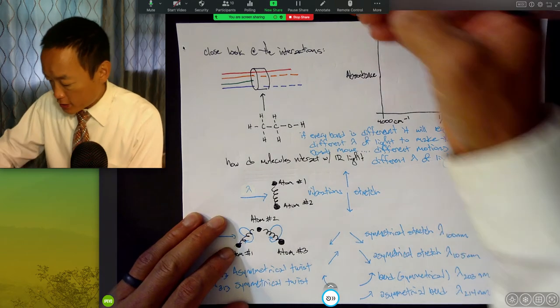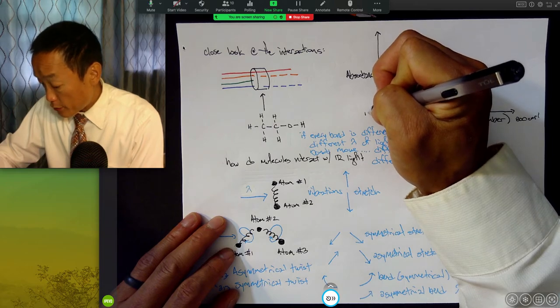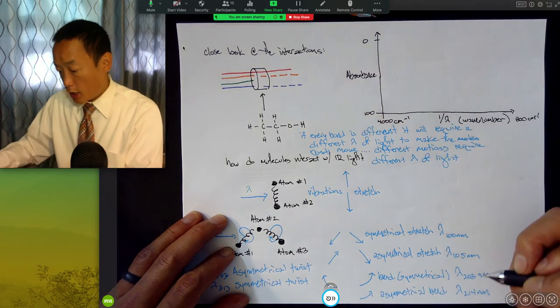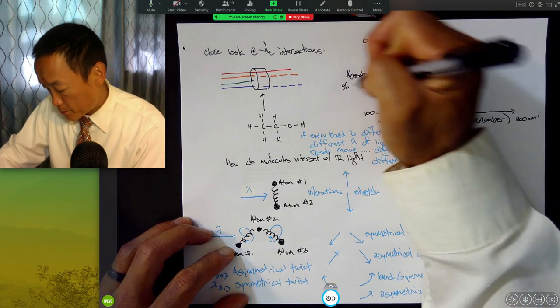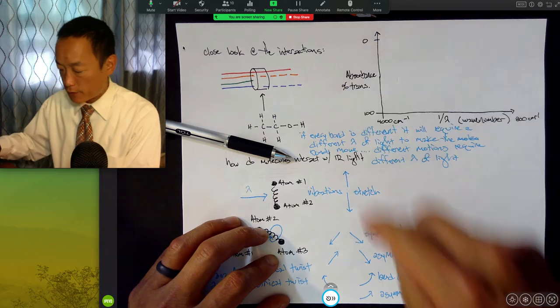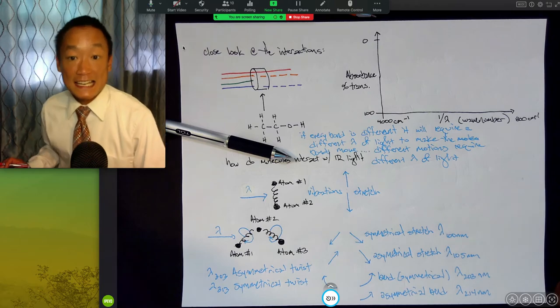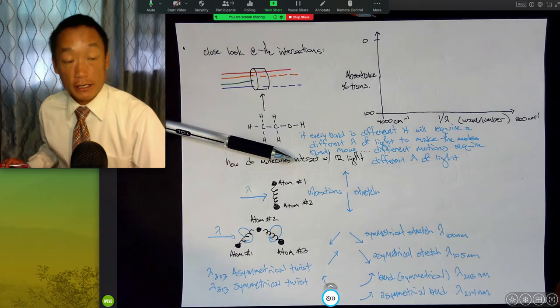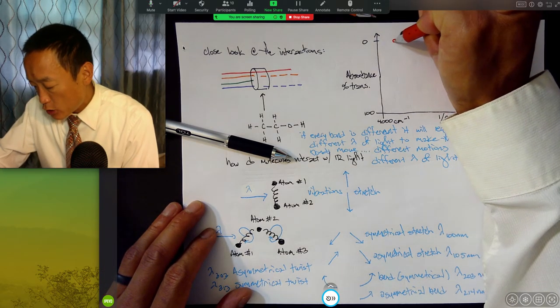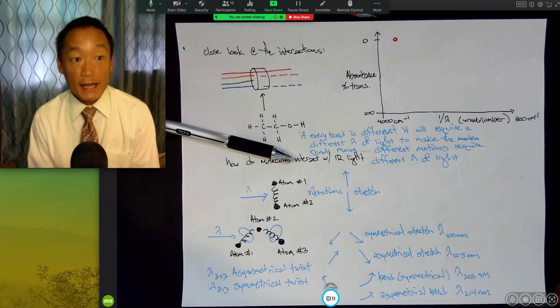And when we look at this, you have 100%, and then you have 0% absorbance. Or another way to look at this would be percent transmittance as well. But more importantly, the idea, regardless of which one of these you're using, is that red wavelength of light passed straight through our sample. It did not at all interact with our sample. And so at that point in time, at that wavelength of light, we would expect 0% of that energy to be absorbed by the molecule.